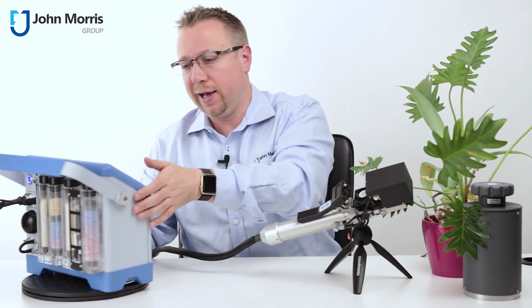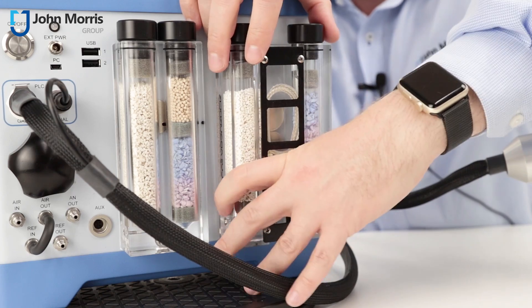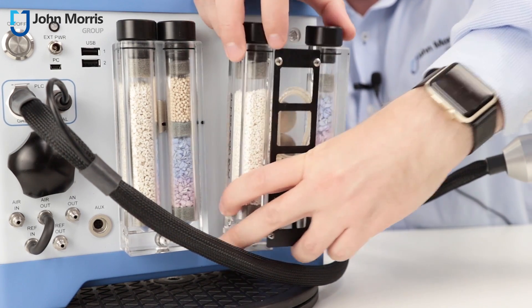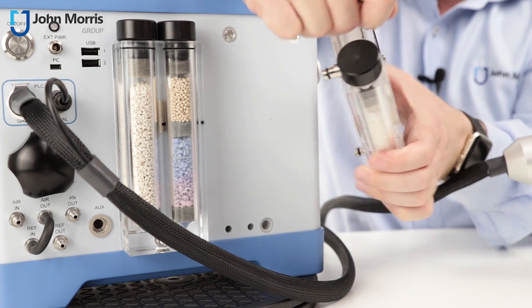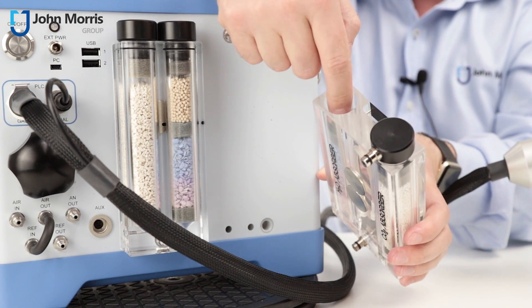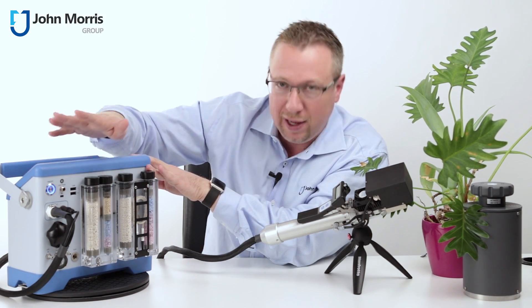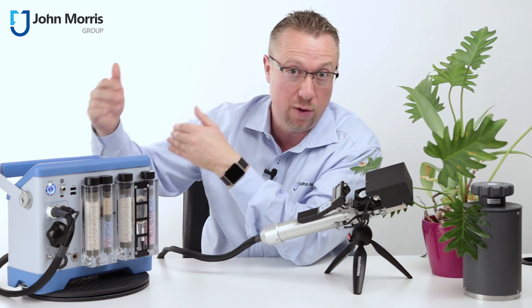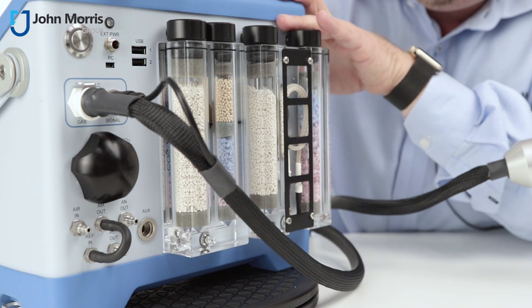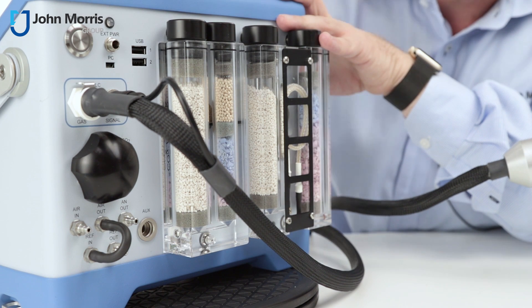Another thing we really like about this particular unit is how easy it is to change desiccants, and you can do this in the field. You can simply just pull these modules off, empty the desiccants out, load new desiccants in, close it up, and slip it straight back on again. We have a combination of desiccant and molecular sieves, and the molecular sieves should probably be changed each time you use the device — that is, each time you take it into the field. If you plan on running the device in your office, you can also just plug it straight into power to run it continuously.